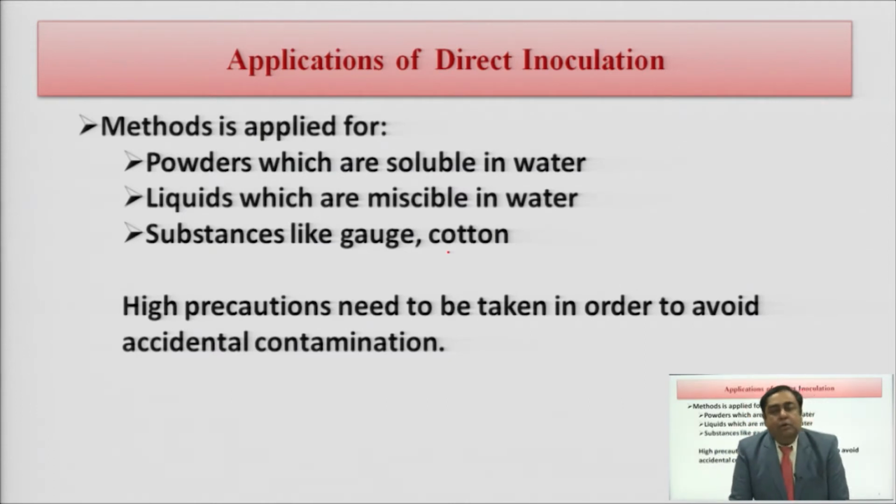Just to rule out that the turbidity has been created by any factors related to the environment, we have to carry out this test in a very aseptic environment. That is, high precautions need to be taken in order to avoid all sorts of accidental contamination.